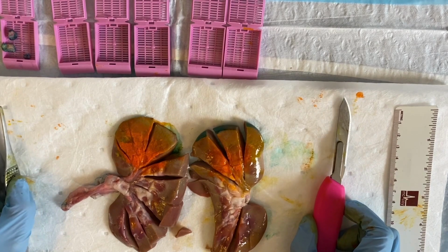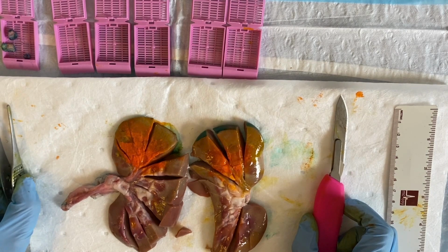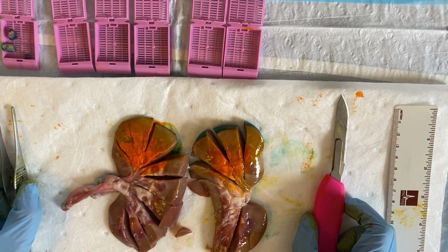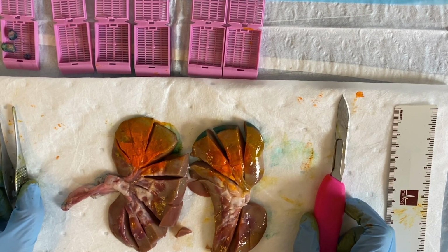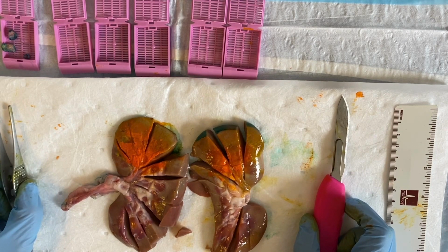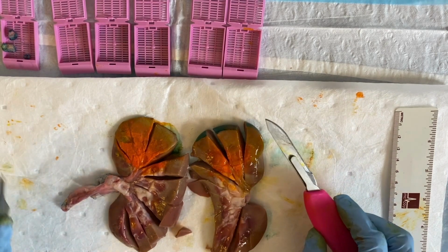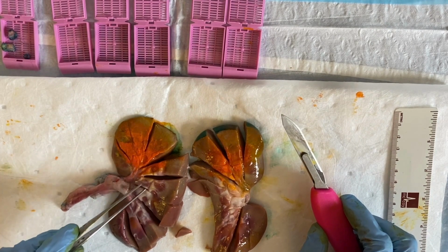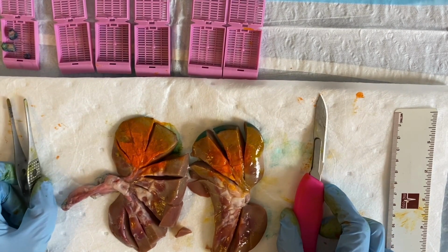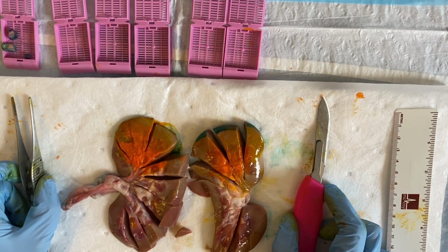After you have bisected your kidney, you will want to observe the location of your lesion. In this case, I have created an orange-yellow ill-defined lesion with ink. After observing where the lesion is located, you will want to serially section the specimen. In this case, I have done a radial section in order to maintain relationships of the lesion to my renal sinus fat. Tumor invasion into renal sinus fat is associated with a poorer prognosis for the patient.